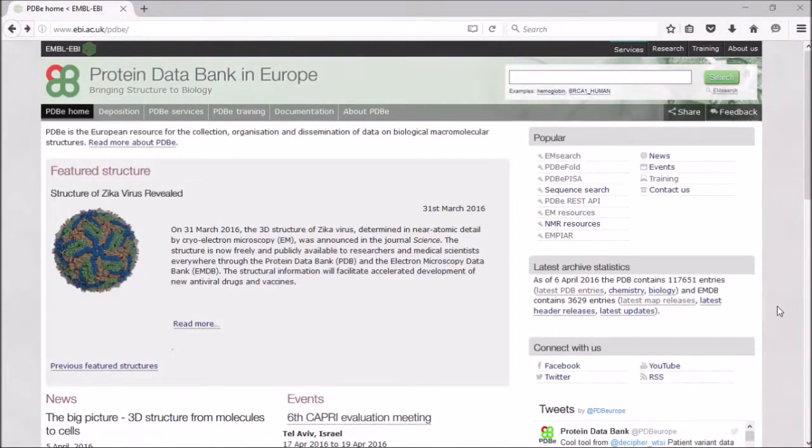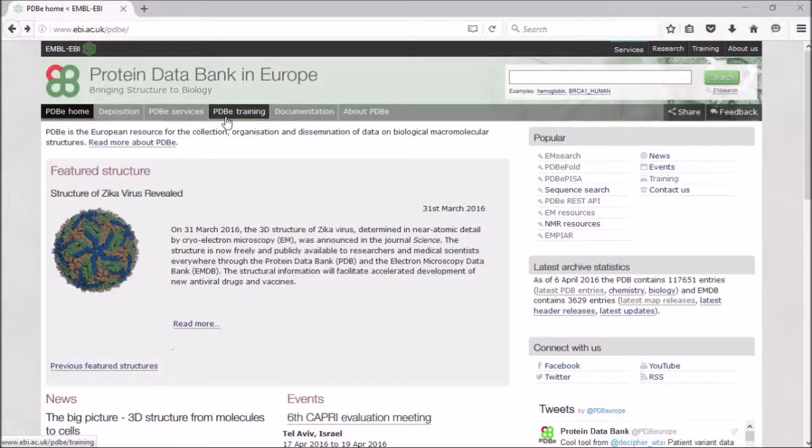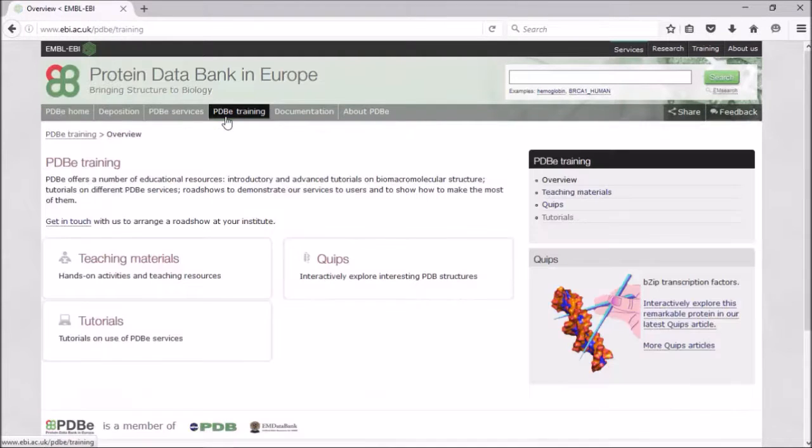We also have an API here at PDBe. Before I move on to that, we'll talk about how you can find out more about Fold and PISA.